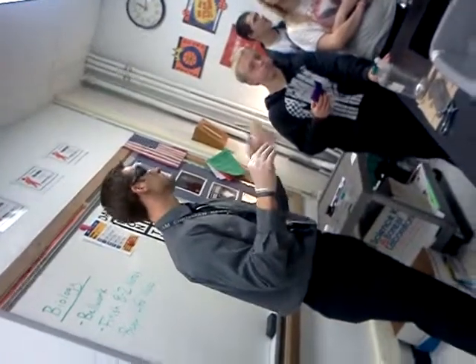All right. Light. Camera. It was short-lived. Whoa! That was cool. I don't have enough to do it again. I'm sorry.